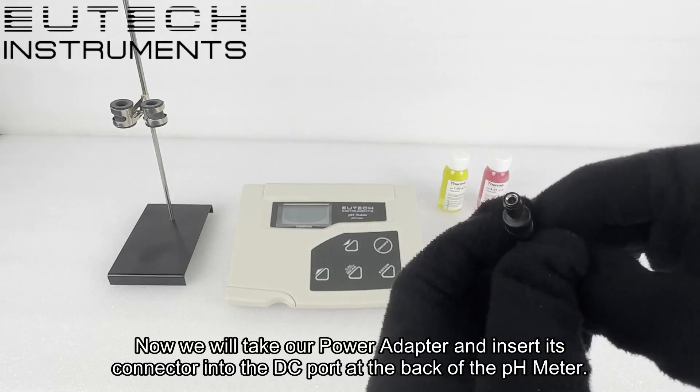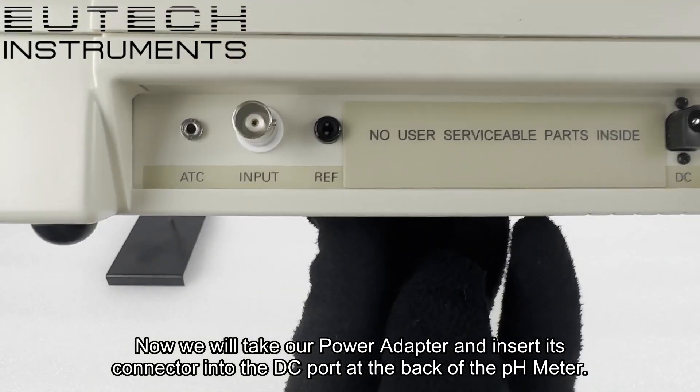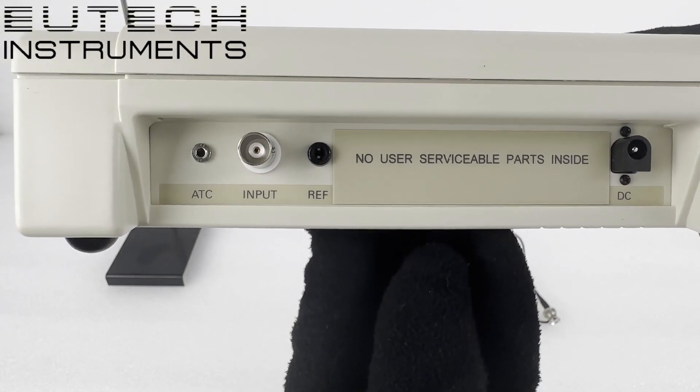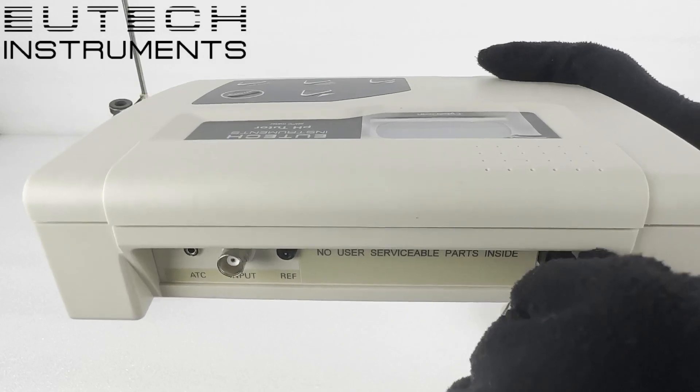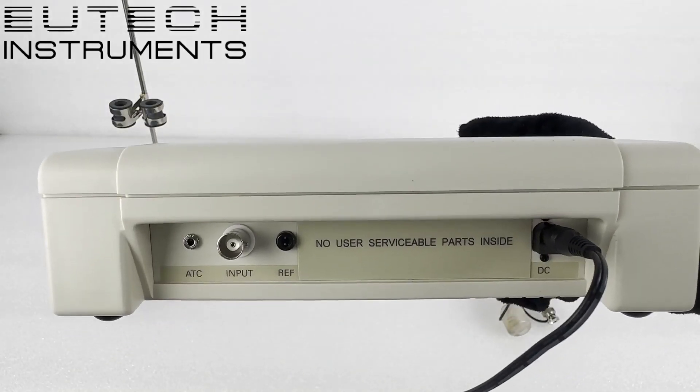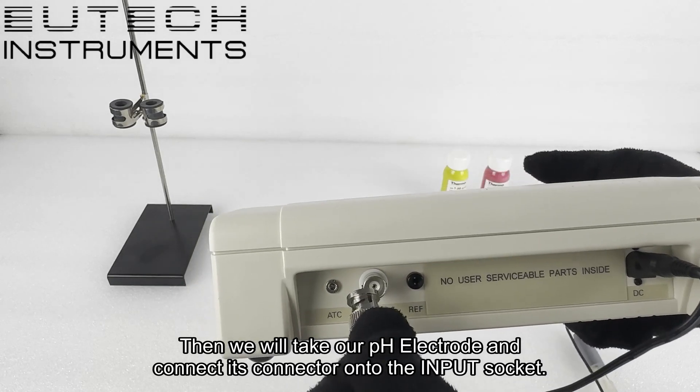Now we will take our power adapter and insert its connector into the DC port at the back of the pH meter. Then we will take our pH electrode and connect its connector onto the input socket.